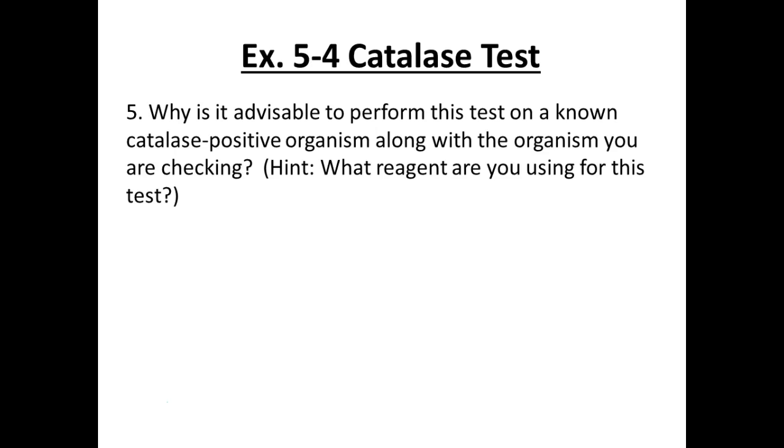Hydrogen peroxide is the reagent we use, right? Because we're testing to see if you have the enzyme catalase. Because what does catalase convert hydrogen peroxide into? Water. Water and gaseous oxygen. That's why you get the bubbling.